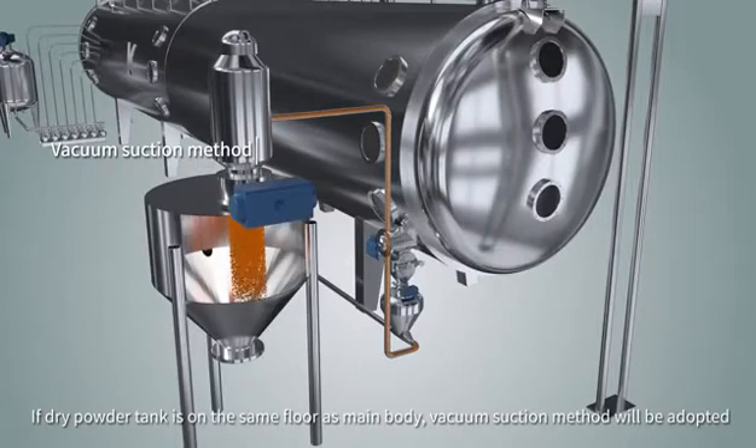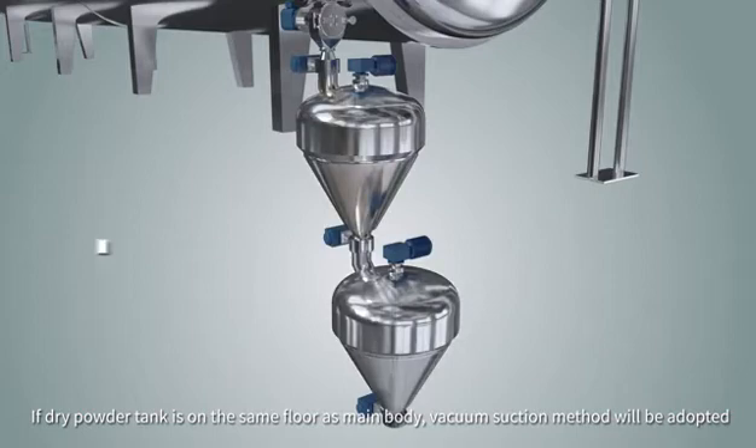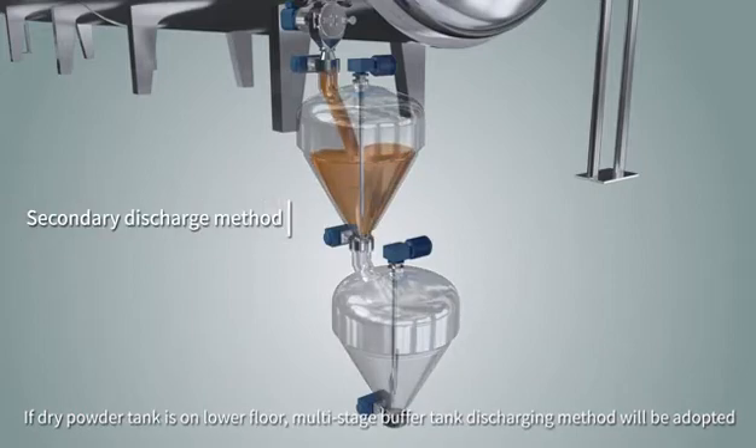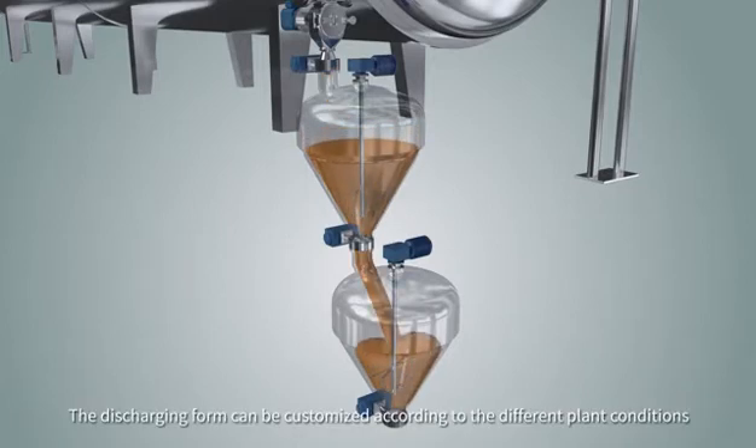If the dry powder tank is on the same floor as the main body, a vacuum suction method will be used. If the dry powder tank is on a lower floor, a multi-stage buffer tank discharging method will be used. The discharging form can be customized according to different plant conditions.